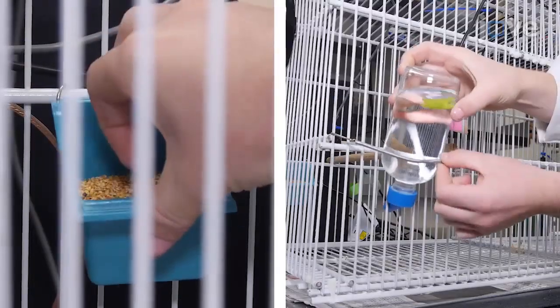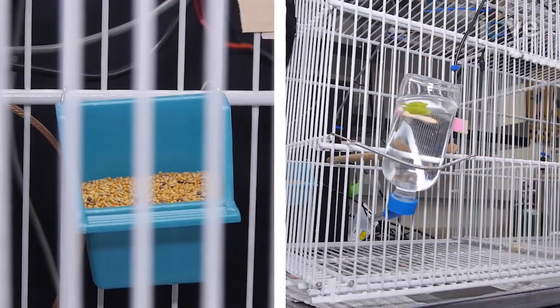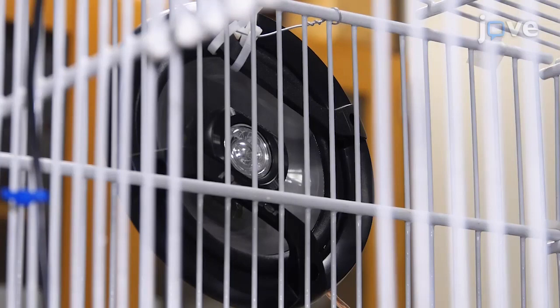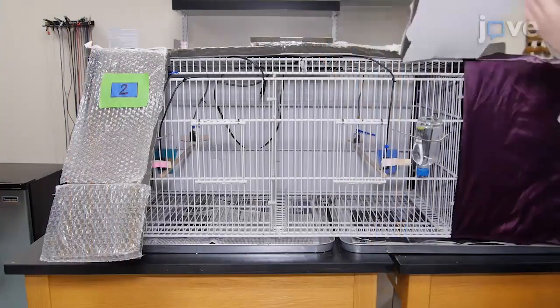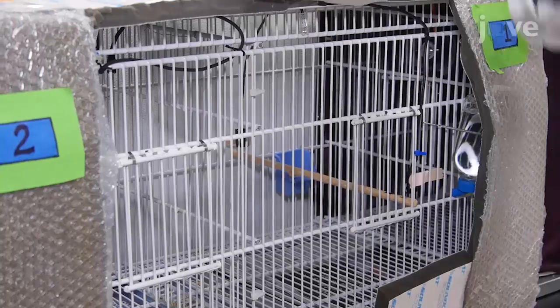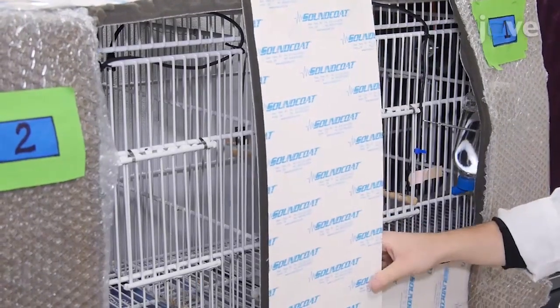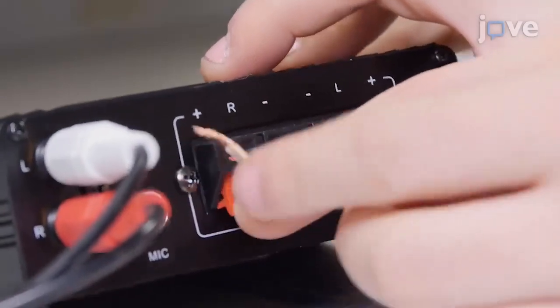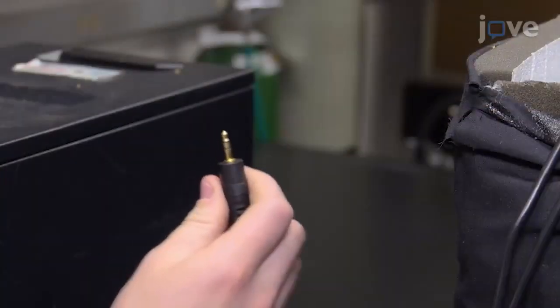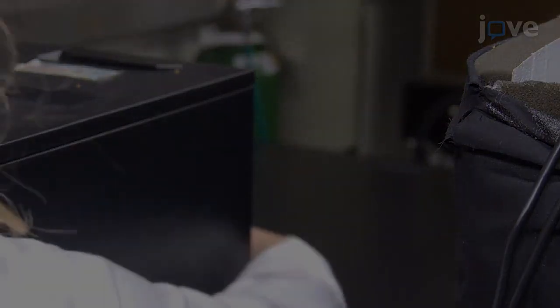Place bird seed and water next to each of the perches, and place a speaker at each end of each chamber. Place anechoic foam on the perimeter of the entire cage, leaving holes for the cage doors and water bottles. Then connect the speaker to an audio amplifier and connect the audio amplifier to the sound output on a computer.